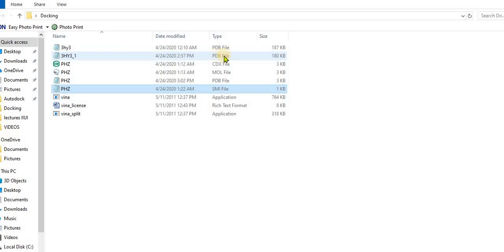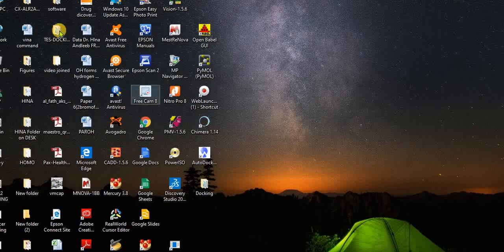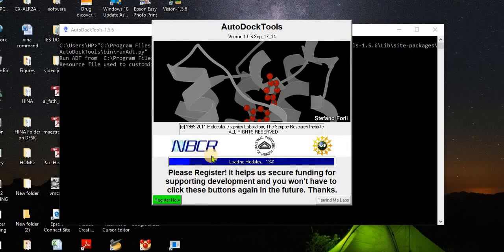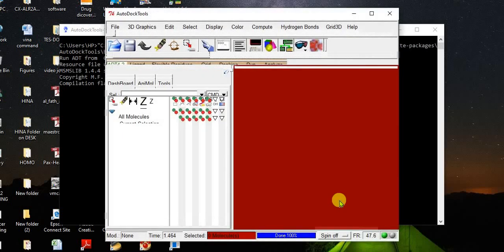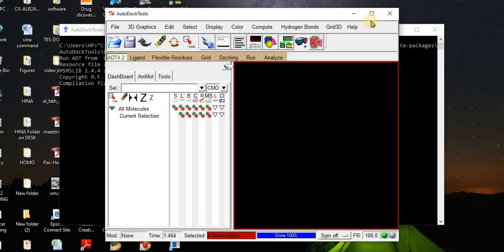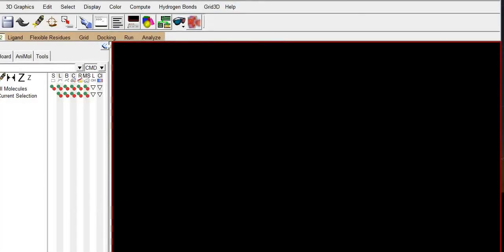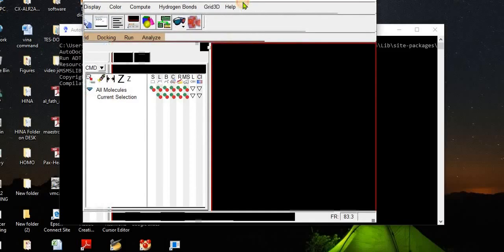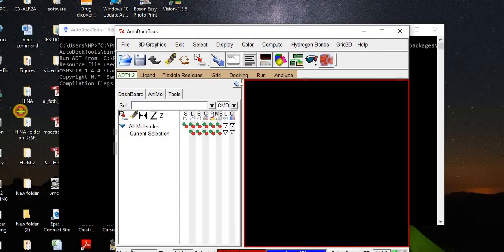Now I'm going to open the structure in AutoDock Tools. Let's find where AutoDock Tools is. I'm clicking on AutoDock Tools — it will take some time to load. We now have AutoDock Tools open.